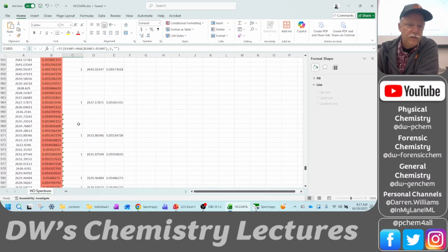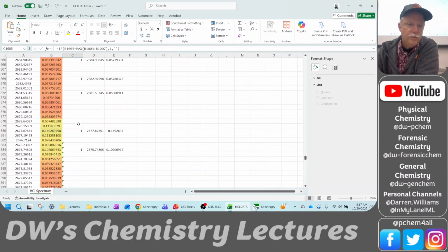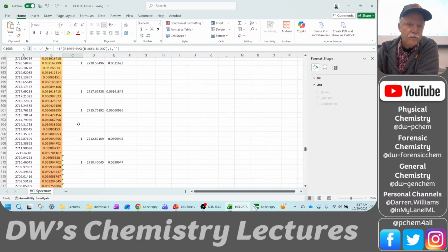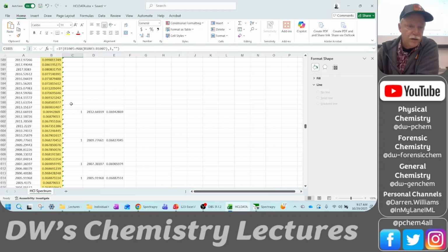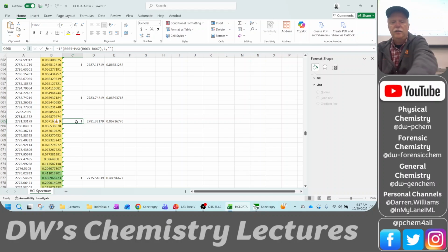You can kind of see, well, that's a bad patch. Let's go up here. Yeah, so here we clearly see some green lines, and some more green ones. We're picking up a lot of noise peaks, so we're just going to delete these.